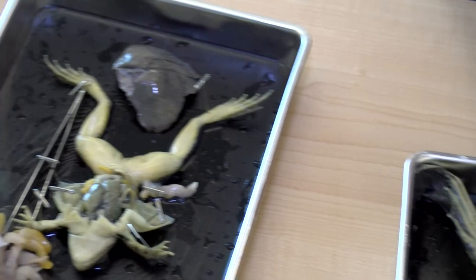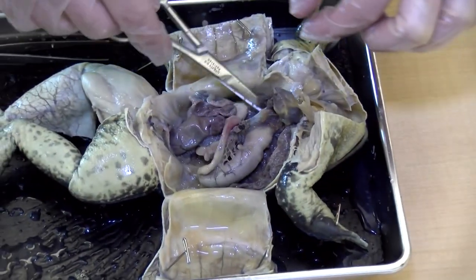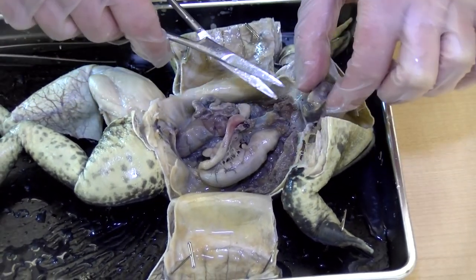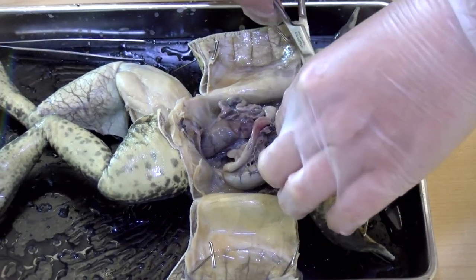Miss Muirhead has removed the liver, which gives us a better shot of the stomach, the small intestine, and large intestine. The heart is up here, which I'm going to remove.